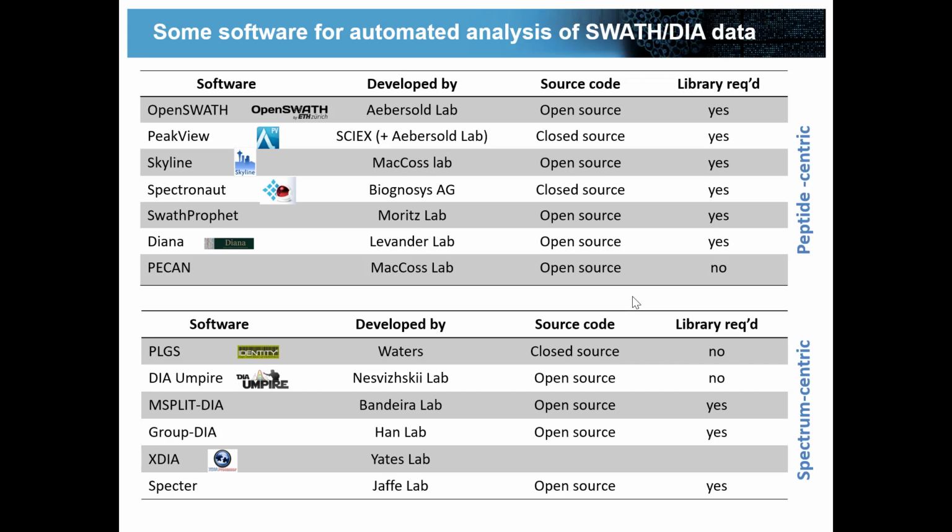If you want to go for something more user-friendly, then I think Skyline is a very good option, and you'll see that tomorrow. But Skyline is also a software that tries to do many things, right? It does SRM, it does PRM, it does MS1 quantification, it does DIA, it does peptides, it does small molecules, it does a lot of things. So Brendan can't necessarily keep up with every cutting-edge paper that comes out. He's very good at adopting the best stuff into the software and trying to keep that up to date, but sometimes it takes a little bit of time.